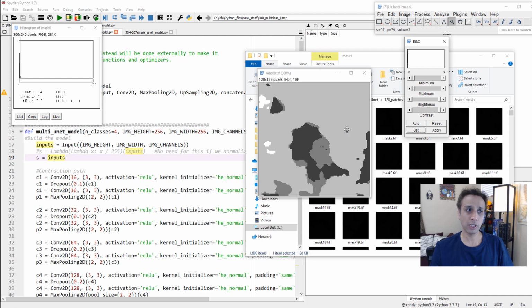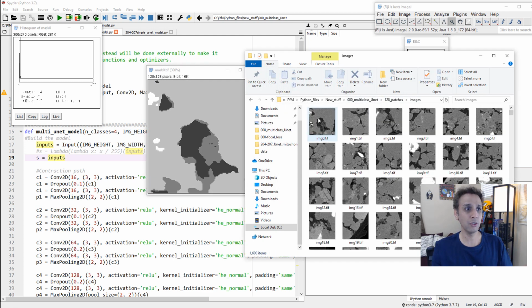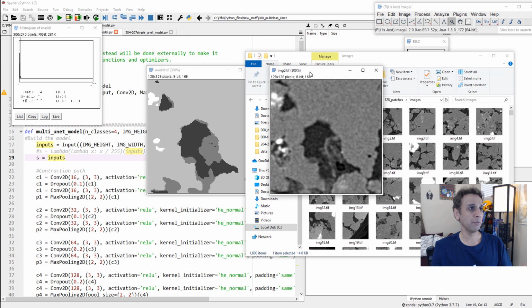This is a very laborious process, right? Or if you have someone else do the labeling for you, great. But the idea is you need to have labeled images, meaning every pixel must mean something. In this image, every pixel means something. There is a reason why I'm spending this much time, because you need to understand exactly what the goal is here. So let's go to 300% so you can see both at the same time.